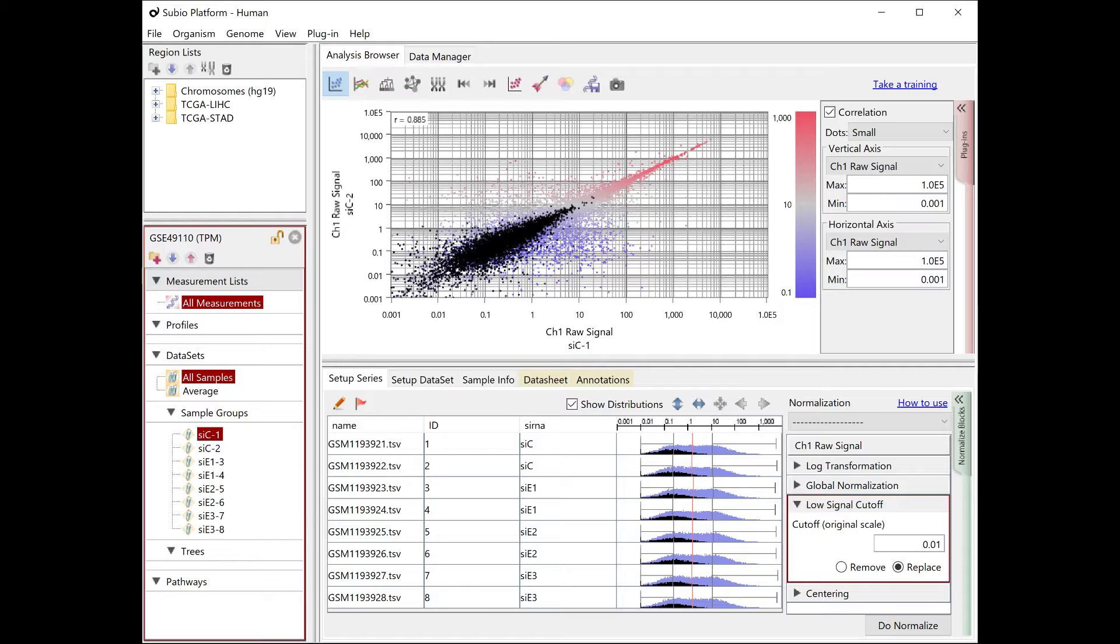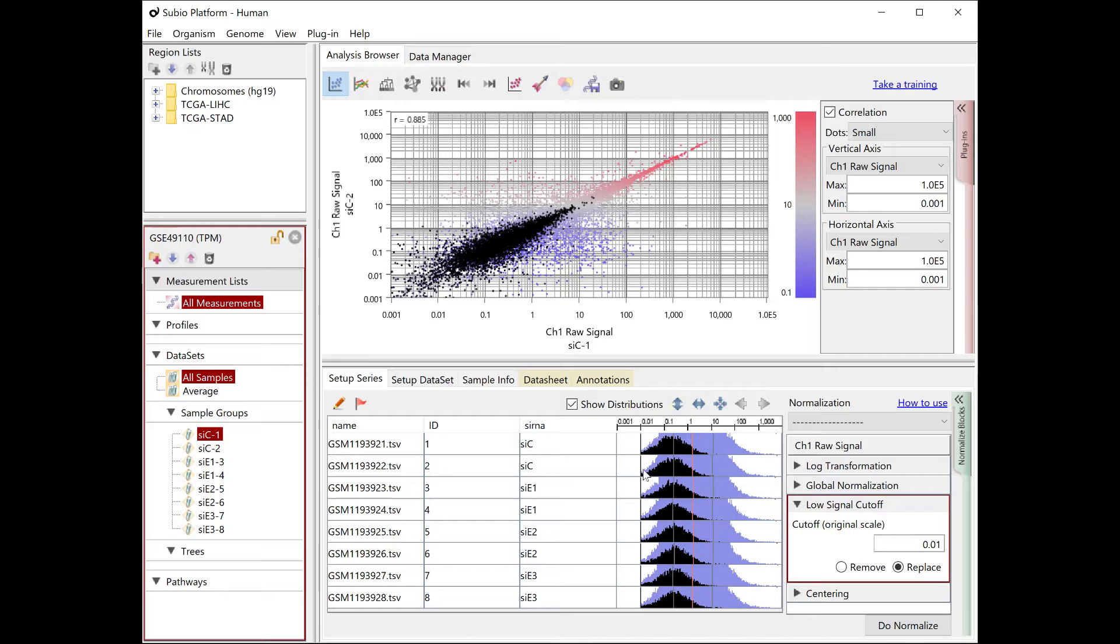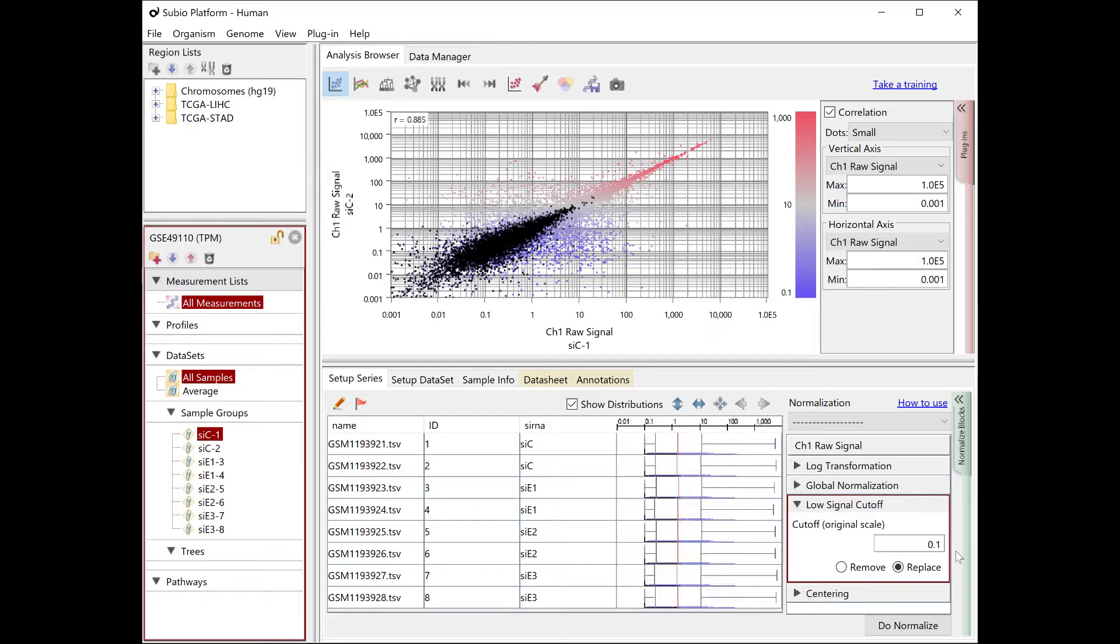In this data, a lower limit of 0.1 would be acceptable, since a noise rate below 0.1 is considered to be high.